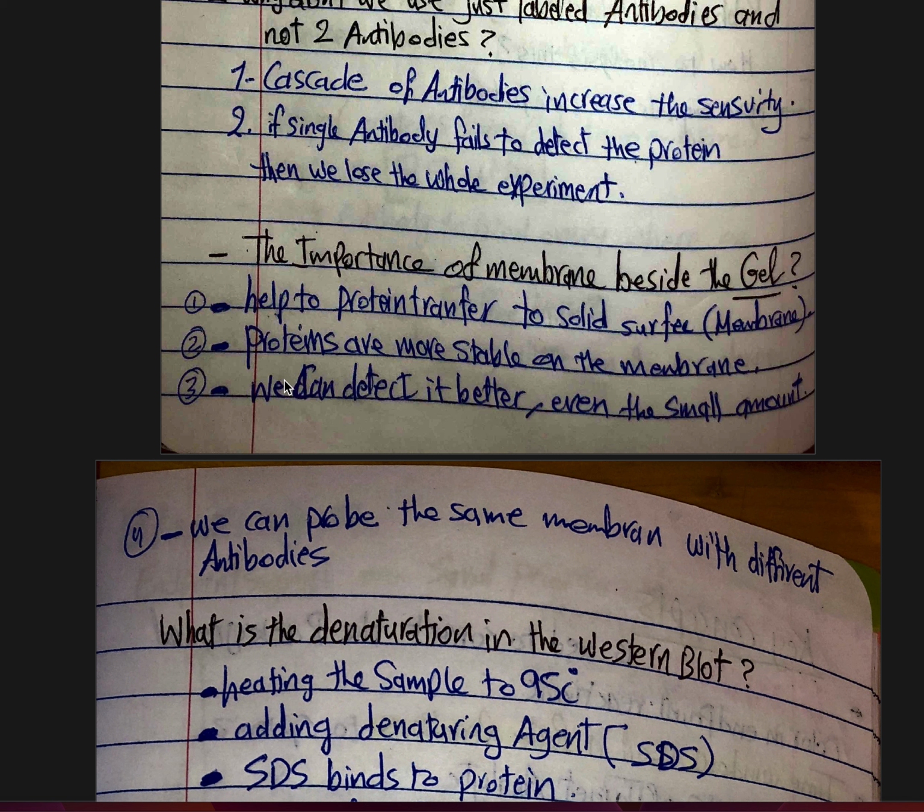And what is facilitating the binding of these proteins on the membrane? Again, methanol. We use the methanol in the transfer buffer, which facilitates the binding of these proteins on the membranes. Why do we actually use the membrane? Because this protein has to be transferred onto a solid surface like a membrane. It is also more stable on the membrane, and the membrane can detect even a small amount of the proteins.